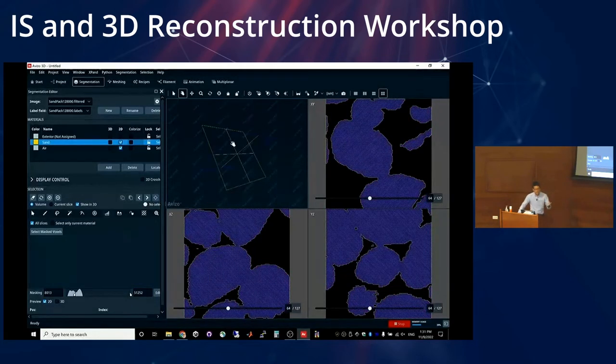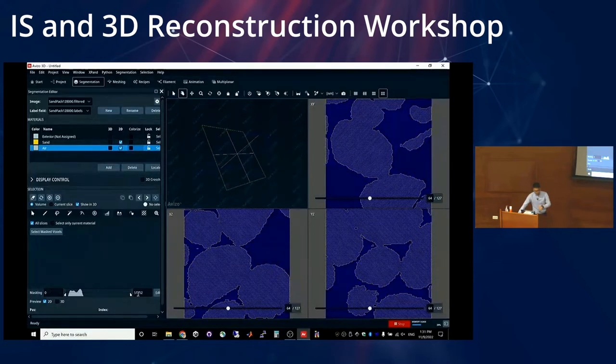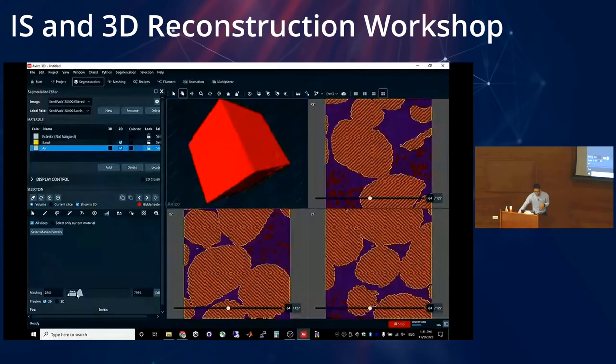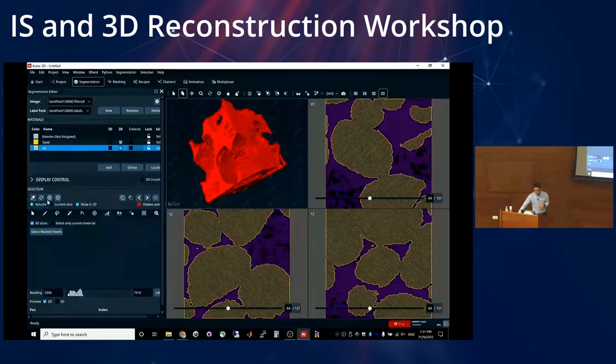Sorry if I'm repeating this a lot, but these are the basics. Later when we go to more complex stuff, you'll have to know this by heart. Okay, so now again, thresholding. Select, and then add. Okay.